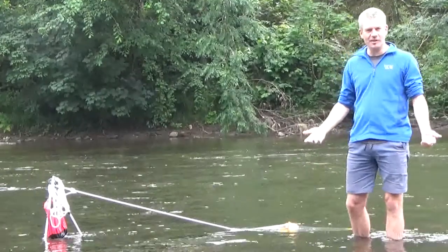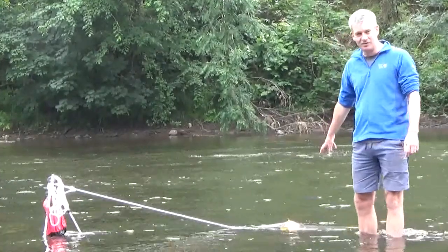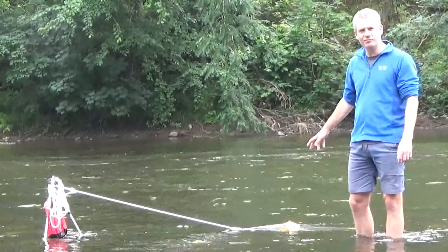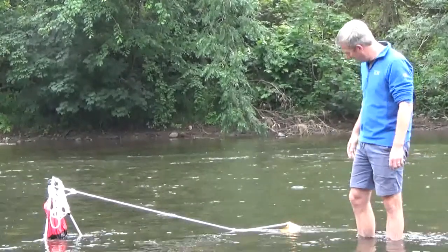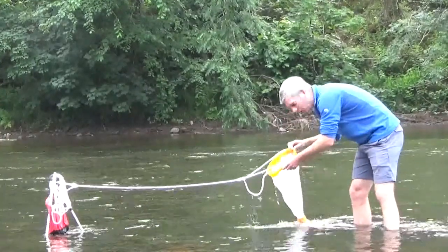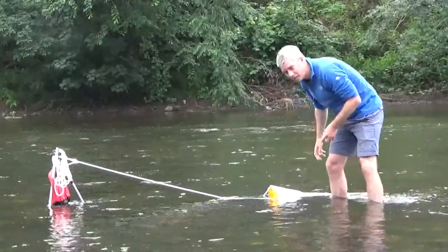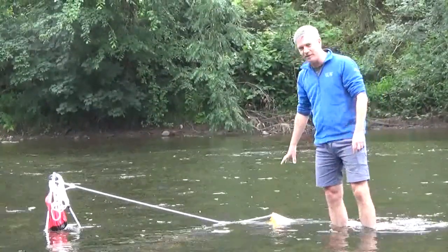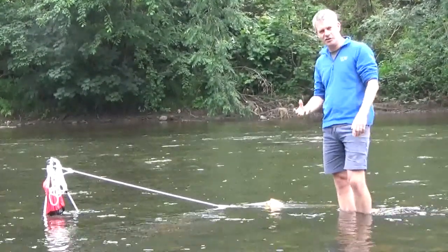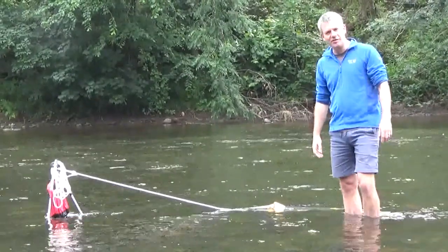We've got to do this with stuff that we can take on the river. This is a 250 micron plankton net — we've had it in the river for about five or ten minutes and already there's quite a bit of sediment in there. We're going to leave that for another five or ten minutes and then take it out, rinse it all down to the little cap at the end of the net, and take it back and have a look under the microscope.